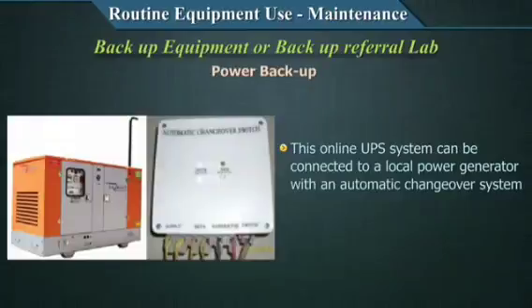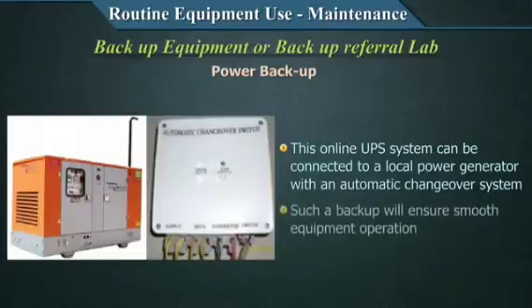And if the online UPS system is connected to a local power generator, especially if it has an automatic changeover system, this will ensure that your operations will not get interrupted till your supply is resumed. Such a backup system will ensure smooth equipment operation if there are prolonged power outages.